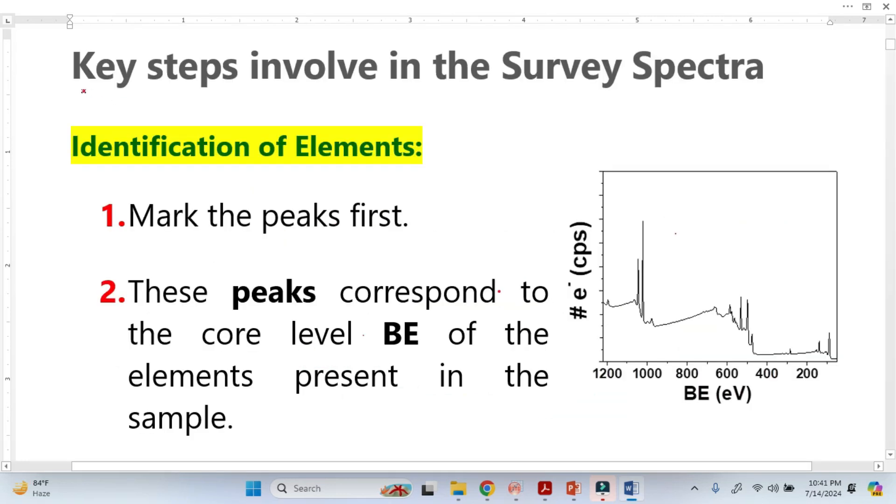Now let's discuss the key steps involved in survey spectra. We use survey spectra for identification of elements. Once we have this survey spectra, the first thing is to mark the peaks like this. This is one peak here, this is another peak, this is another peak. There are many peaks. For simplicity I just marked four peaks and we can do this by Origin.